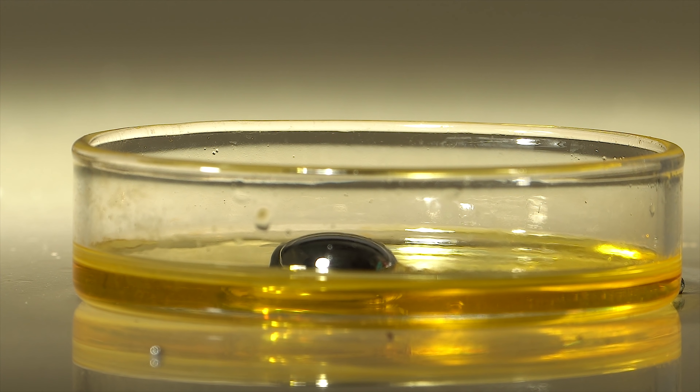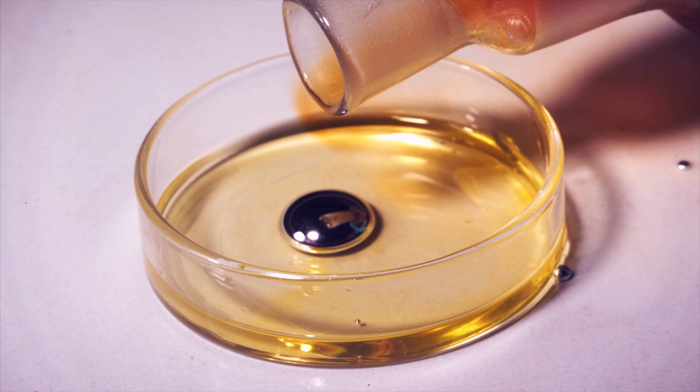And now take a look at slow-motion footage of bromine vapors contacting the surface of the gallium drop.